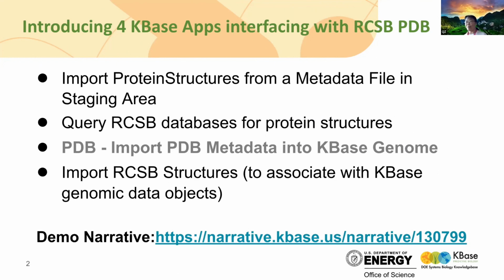KBase saves data into objects instead of files. This app will take a CSV file as a metadata file to define what data the user wants to link his or her KBase data with the RCSB structures. So that's the first app.